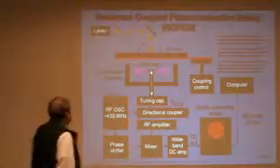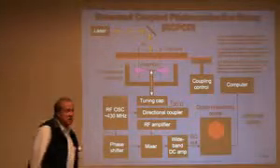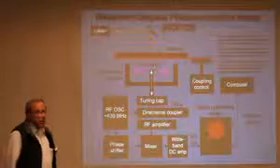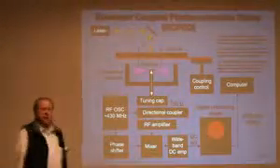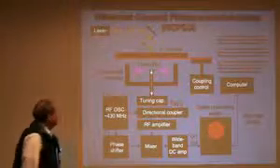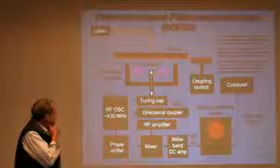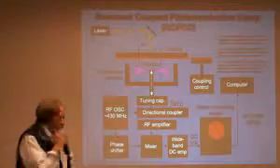Changes in the sample conductivity are coupled through the antenna system to the detection system, and the outcome is a transient. In the case of pulse excitation, the outcome is a transient profile of carrier decay. After processing and conversion of the AC to a DC transient, we get a detailed decay of the carrier lifetime after pulse excitation.